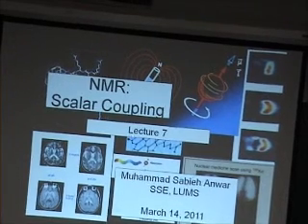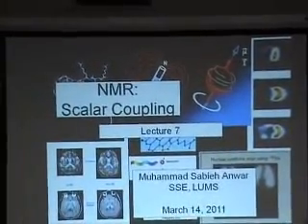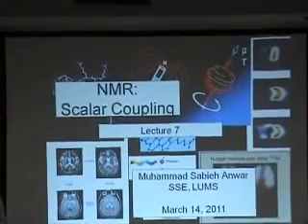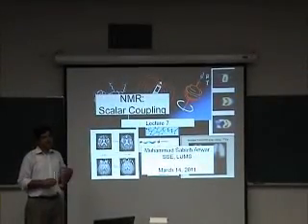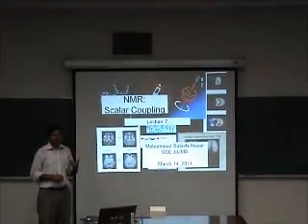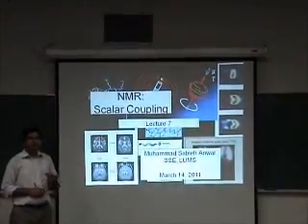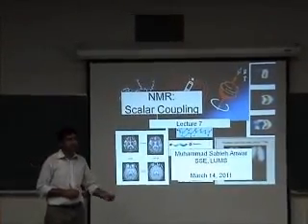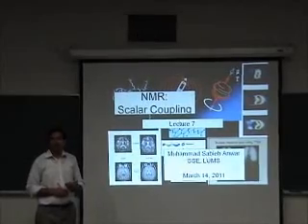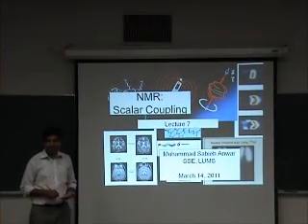of scalar coupling. We discussed chemical shifts in the previous lecture. The second most important aspect of NMR spectroscopy is scalar coupling. We observed the other day that due to the chemical shift phenomenon, the same nuclei or the same isotope existing at different positions within a molecule has a characteristic Larmor frequency. That was the chemical shift phenomenon.